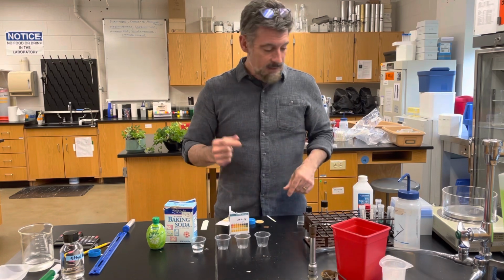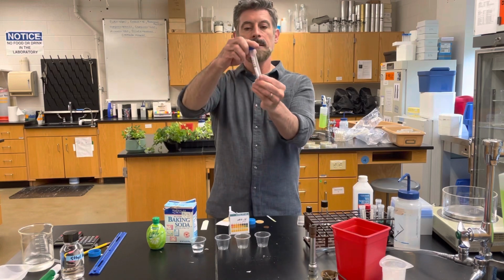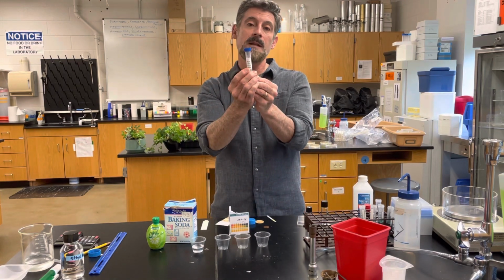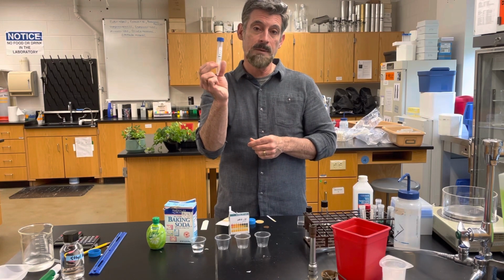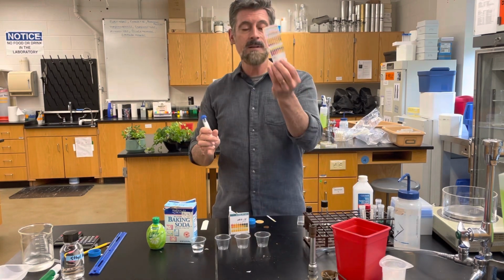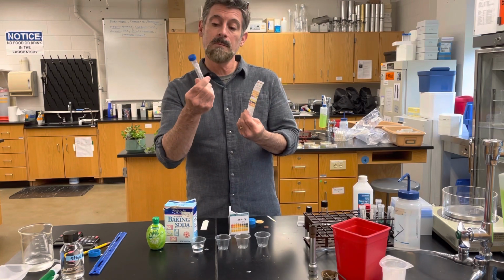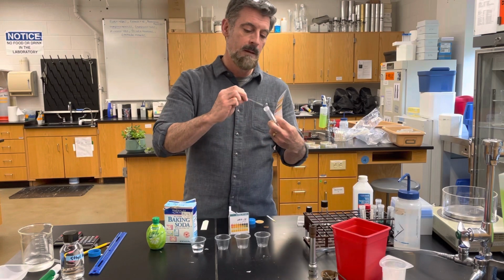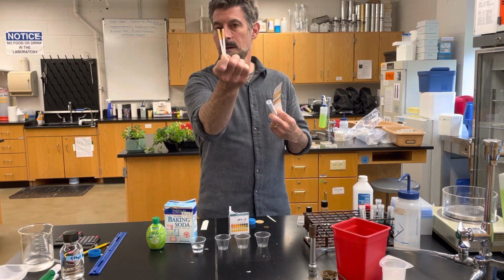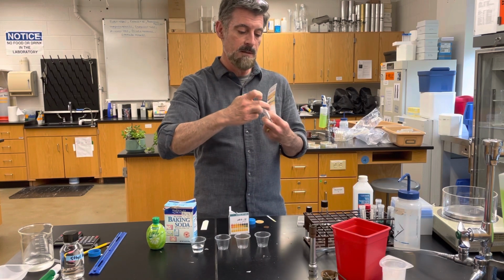So what we're going to do is, in your lab kit we have a little tube like this, and it's labeled pH test strips. There should be 6 of them in here, 6 little pH test strips. You also have in your kit a guide to decipher the pH. So each little test strip that you're going to see has a couple little colored squares on them. So there should be 4 different squares on them.